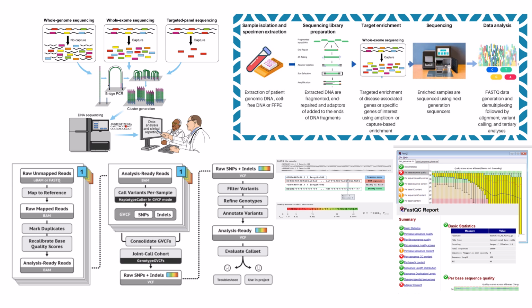Okay, so phase 3 gets everything lined up perfectly and polishes the data quality to a high shine. You could say that. It ensures every piece of the puzzle is in its place, and the data is highly trustworthy. Right, so data cleaned, mapped, refined. Now for the main event, right, the actual hunt for the differences between this patient's DNA and that standard reference genome. Phase 4. Discovering genetic variations, variant calling.